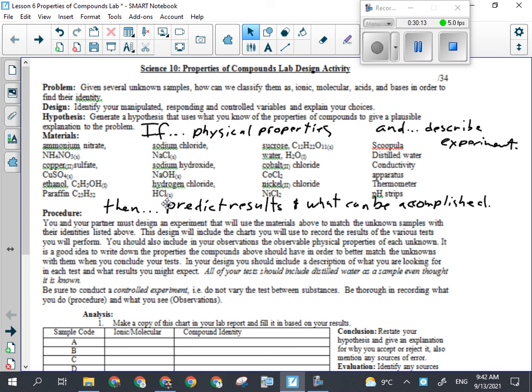What was that thing you called again, sorry? This is a conductivity tester. Well, actually, it says indicator. Conductivity indicator. The conductivity indicator is really easy to use. Push the button on the side, and the little red light that says "on" will light up. That's important because the old ones we had didn't have that light. You couldn't tell whether the battery was dead or the solution was non-conductive. This tells you whether it's working or not.